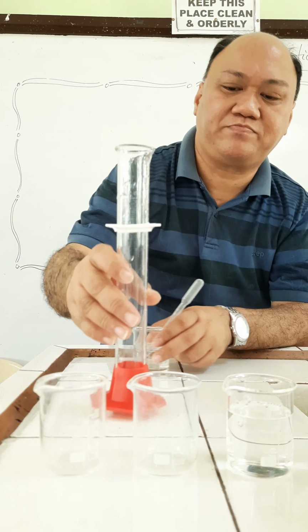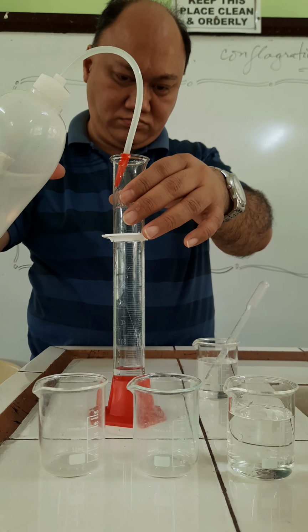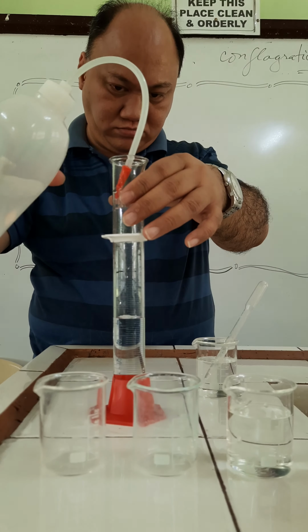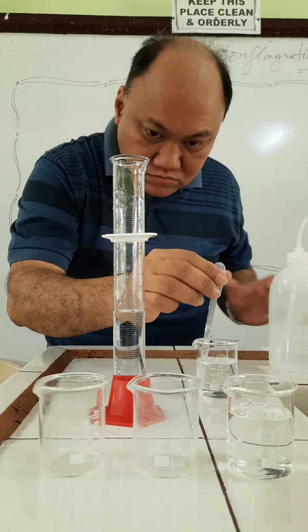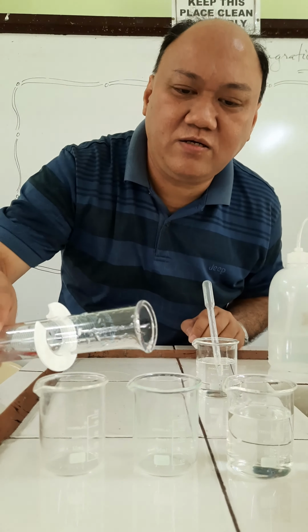Okay. I'll measure another 50 ml. Okay, I'll put it on beaker 2.